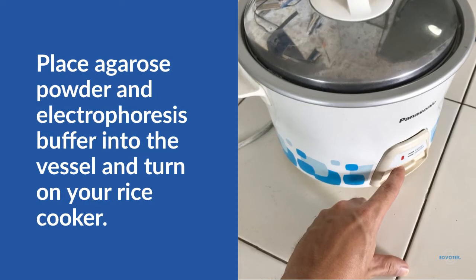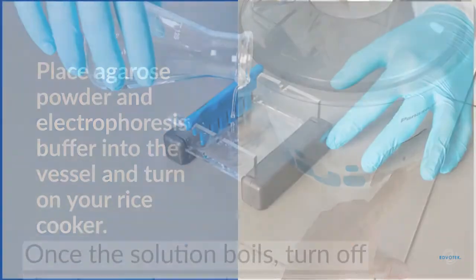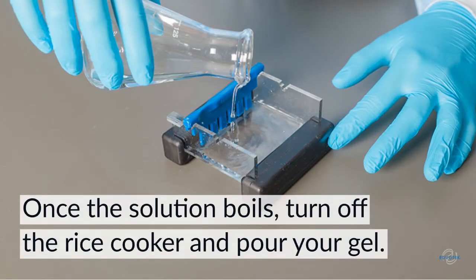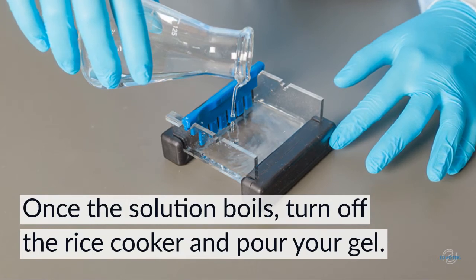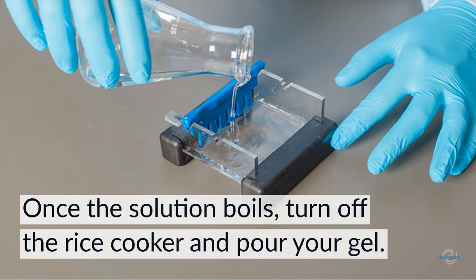To use the rice cooker to prepare your gel, first measure your diluted electrophoresis buffer and your agarose powder and place it into the vessel. Close the lid, plug in your rice cooker, and turn it on. Within 5 to 10 minutes, your solution should be boiling. Turn off your rice cooker and allow the molten agarose to cool to 60 degrees Celsius. At this point, the solution is cool enough to add cyber-safe stain, if needed for your experiment, before pouring your gel.